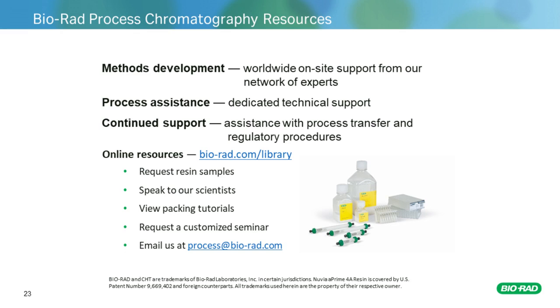In general, by salt tolerance we mean, in process purification, that you don't have to manipulate the feed stream or the sample a lot in order to achieve a good binding capacity. For example, as we know, for ion exchangers a lot of times you are advised to do dilution or reduce conductivity in order to have a good binding capacity. But for most of the mixed mode resins, like those with hydrophobic character, you can actually have your buffer with a modest concentration of salt and you still have good binding capacity and selectivity. This often can simplify the step transition between your different purification methods without a lot of sample manipulation.